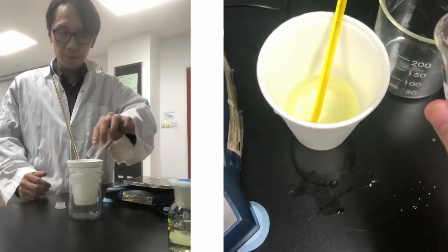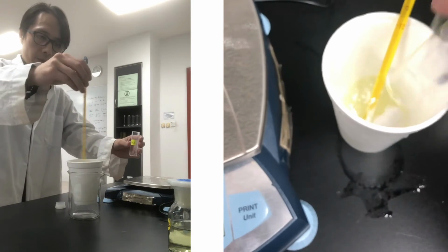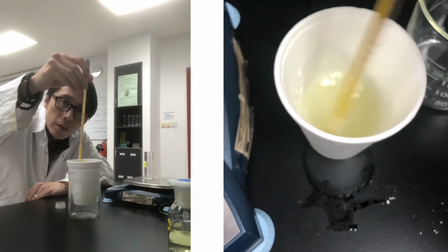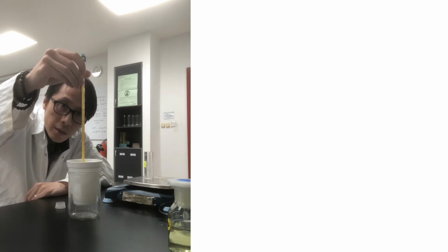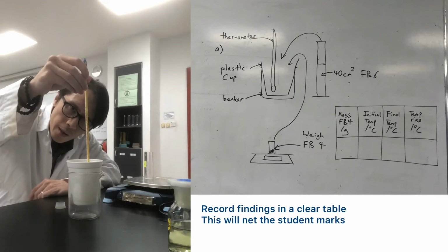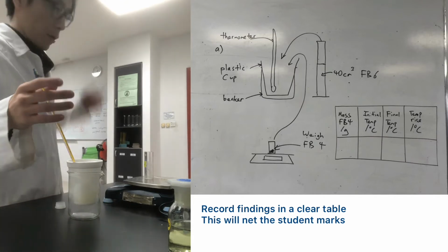I'm going to pour everything in and stir it with my thermometer here. So let's look at the temperature change. It's still rising. Still rising. Avoid holding the thermometer at the very middle. Okay, still rising a little bit. It's going to peak at 43. Check. All the solids gone. Verify. Yep, 43 degrees Celsius. So that should go into your measurements on the table.